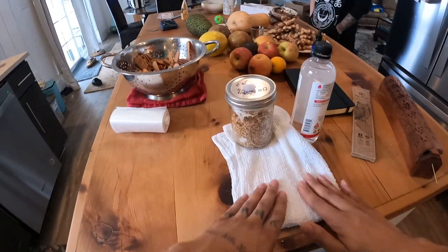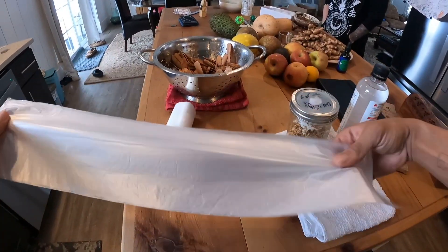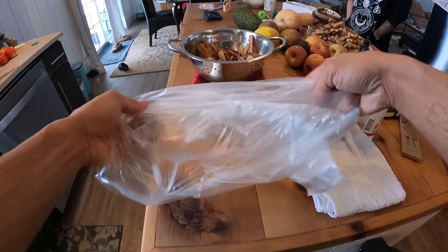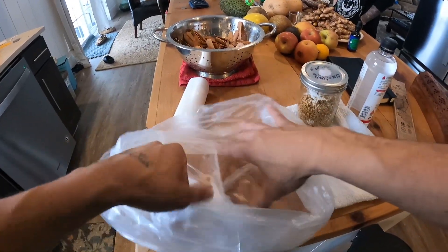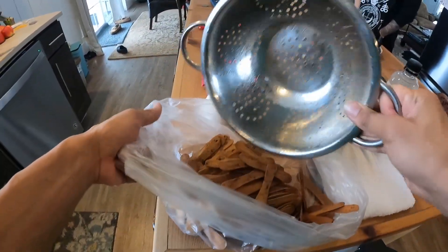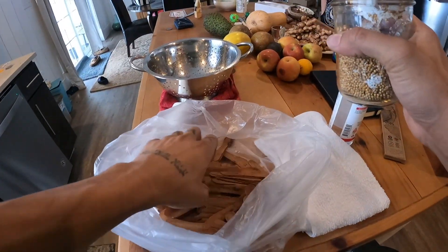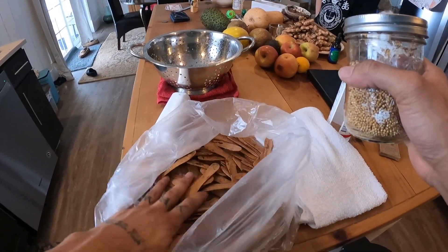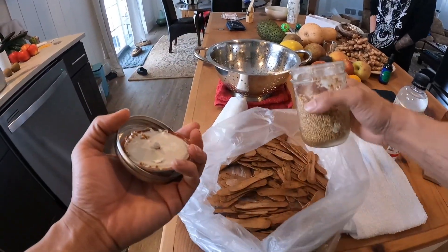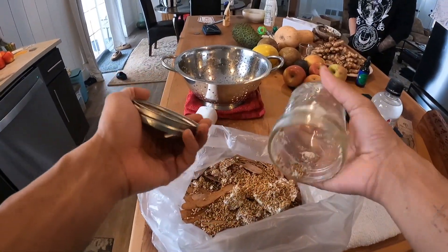My hands are clean from the alcohol as well. I'm going to go ahead and get a clean, clear plastic bag so I can see what's going on inside. I'm going to introduce my popsicle sticks and make sure they're not hot to the touch — as long as they're not so hot that they'll burn me, they're not going to kill my mushrooms or my mycelium.